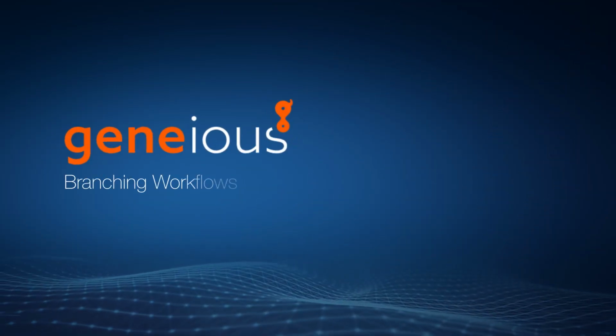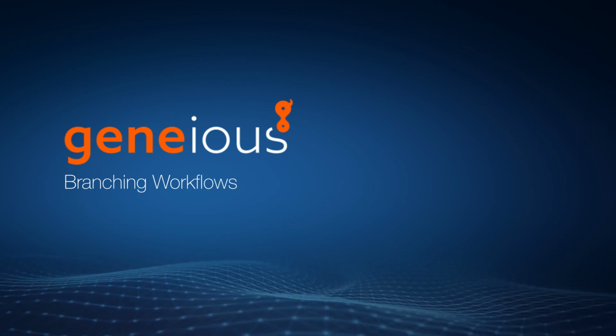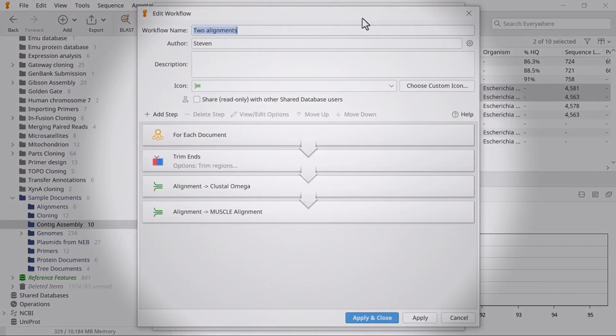Finally, let's look at how to apply branching to a workflow. You can use branching to run two different operations on the same input document in a single workflow. For example, I want this workflow to trim the reads, perform a separate alignment by Clustal Omega and Muscle, and save the results in separate subfolders. This is where branching can be helpful.